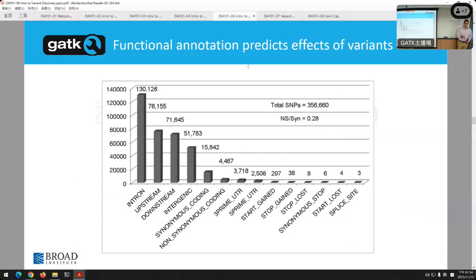And if you're missing one of those bases, everything gets shifted. It's called a frame shift. And so that one base deletion can have a major effect on the entire translation of that gene, of that exon. Right? So we try to annotate every mutation with its potential effect on the body, on the genome.